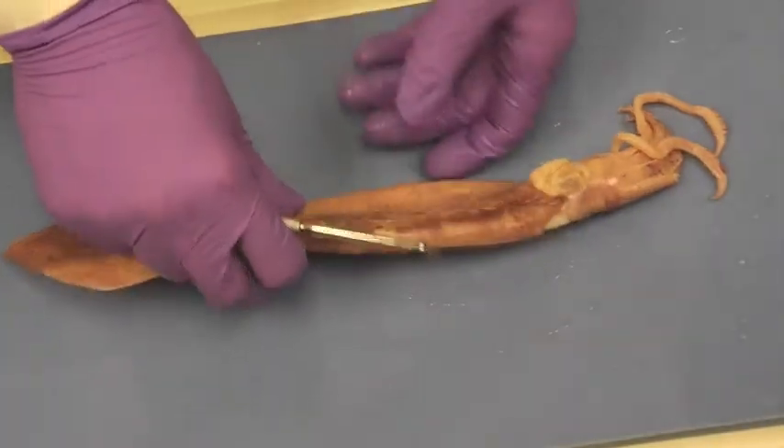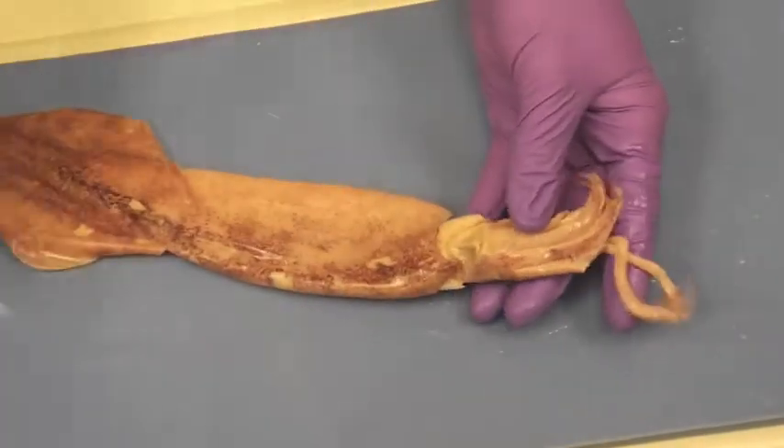I'm Cameron Ford. Hi, I'm Colin Selchuk, and this is the squid dissection. So this is your squid. We're going to go over the external anatomy.